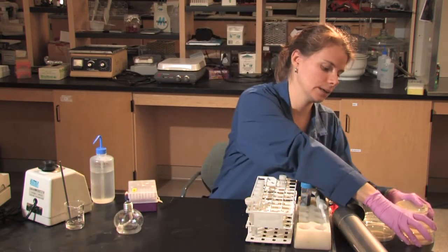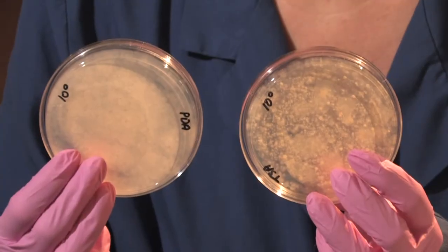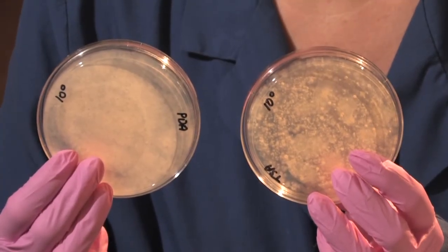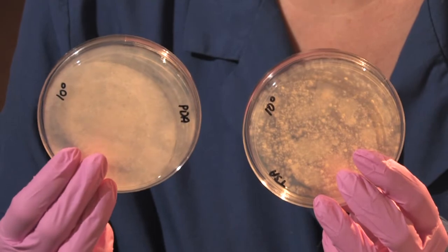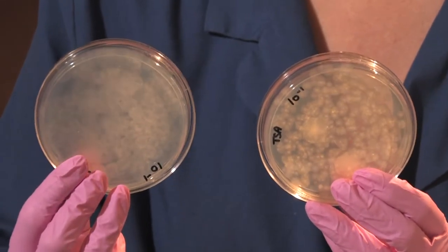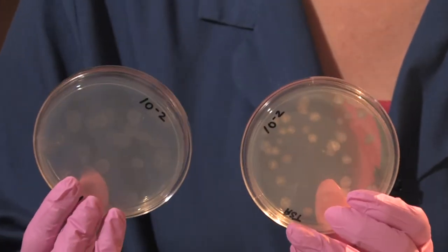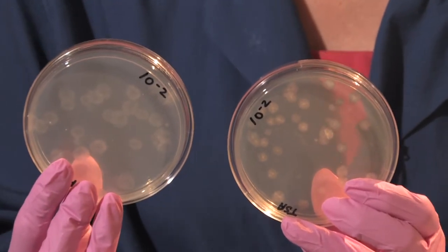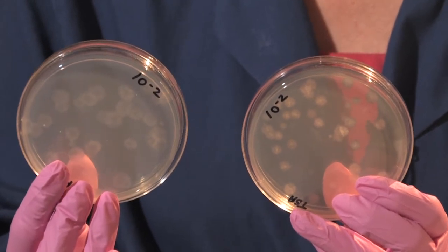I've prepared a few plates in advance. Here's my 10 to the zero dilution, and as you can see, it's a lawn of bacteria or fungal growth on the plate — it's very difficult to distinguish between the colonies. The 10 to the minus 1 is the same situation where the plate is covered with bacteria and fungi. Then I have my 10 to the minus 2, and now I can start to distinguish between the colonies and count. I'm looking for about 30 to 300 colonies so that I can get a good plate count.